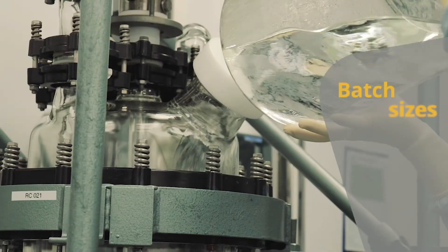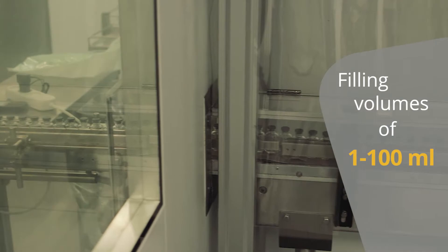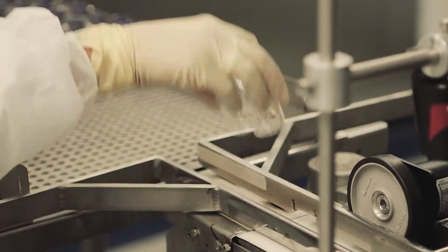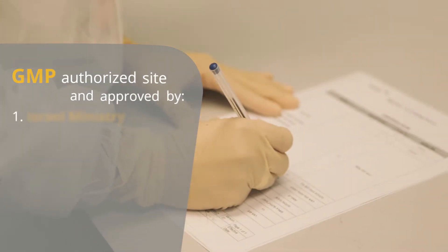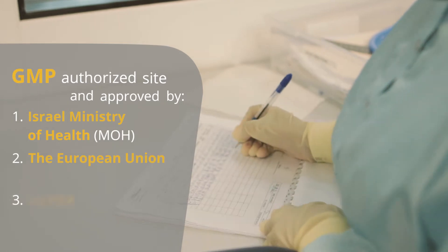We can provide batch sizes of up to 10,000 bottles and filling volumes of 1 milliliter to 100 milliliters based on your demands. GMP authorized site and approved by Israel Ministry of Health, the European Union, and US FDA.